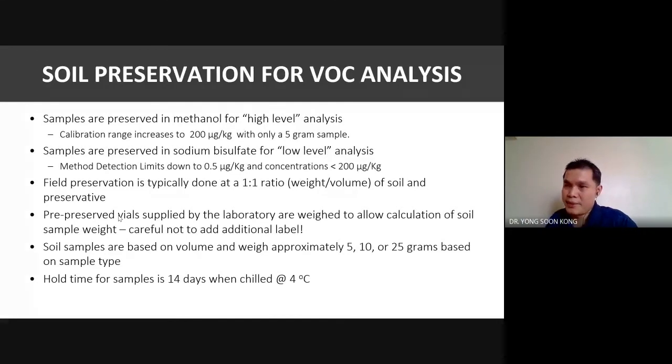Because why? If you ask me, do you have VOC right now in your room, in my room? I would say yes. The question is how much and what type. Why do we need to preserve this one, and why do we need to ensure that they are clean? Because cross-contamination of VOC happens so easily due to the fact that VOC is volatile. Sometimes when you open the vial, VOC can come in because VOC is very mobile due to the flow of wind. They can easily go to your cap and then you close it.